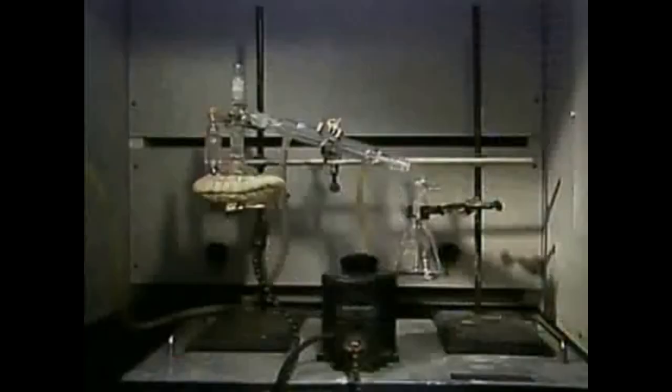During the distillation process, a liquid mixture is separated by vaporizing one or more components of the mixture, and then the vapors are condensed. In this part, we're going to look at how a binary liquid mixture, that is, a mixture that has two components, can be separated into a lighter component and a heavier component. We've set up a laboratory demonstration to do this.